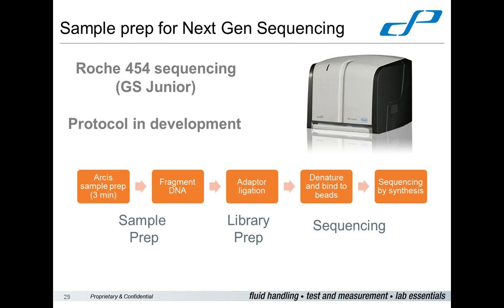So if we can stay on sequencing for a while, we moved on from pyro into what is basically massively parallel pyrosequencing, the Roche 454. In this study, it was the GS Junior platform. Still extensively used in clinical laboratories, definitely still used in our development laboratory. And this is more of a work in progress, but we do have solid data, which I'll show you next. And once again, just like the pyrosequencing workflow, we were able to reduce the upfront nucleic acid extraction time.